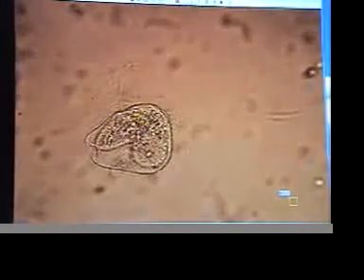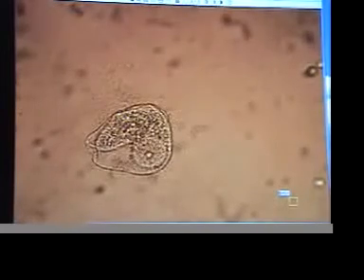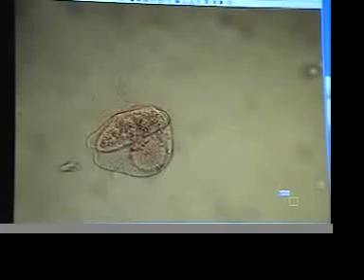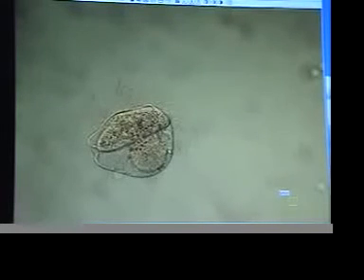And now we'll see interesting changes. I have to make a few adjustments here very quickly on the microscope. Here we go. Now we should have maximum effect of the DIC. There you go. So we'll be able to get very interesting texture and color information.